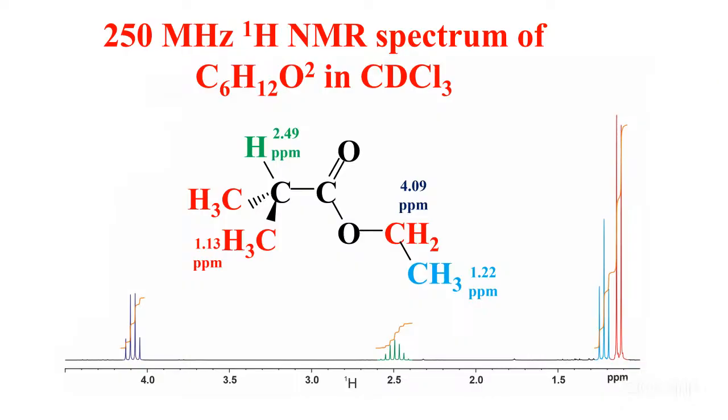Another one. Sir, can I ask one question? Please ask. Sir, here it is mentioned CDCl3 as the solvent. Sometimes DMSO we also use. So, which is a better solvent for NMR? Okay. That depends upon your sample molecule. All are not soluble in all solvents. There is no universal solvent to say everything will dissolve in a particular solvent.